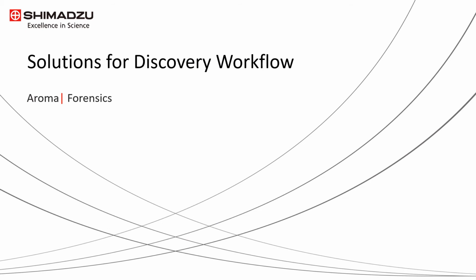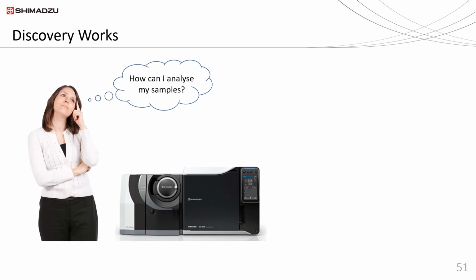Moving on, let us explore the discovery workflow, which is usually these two applications, aroma and forensics. These two applications can also be routine analysis, but most of the time, their initial nature of investigations is discovery and open-ended questions. When it comes to discovery work, we are usually presented with different types of samples. The sample could be solid, liquid, gaseous, and may come in different sizes and forms.